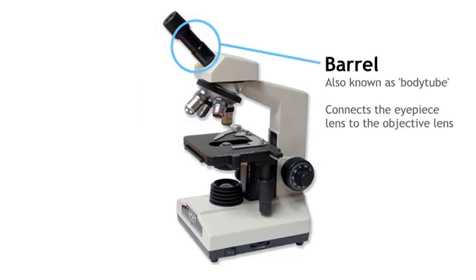The barrel. It is also known as the body tube. The barrel connects the eyepiece lens to the objective lens, which we'll look at in a minute.